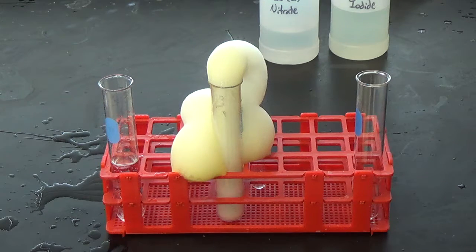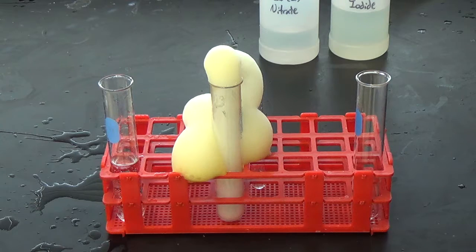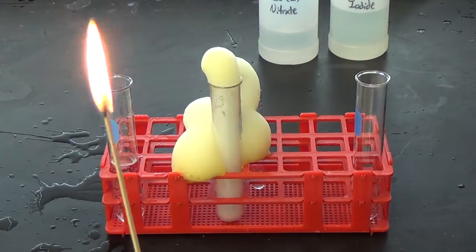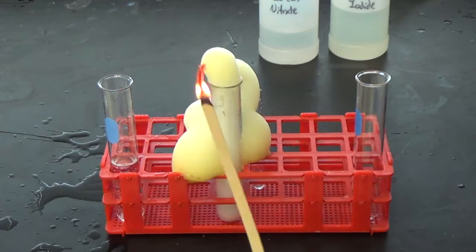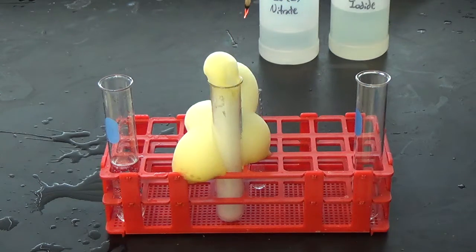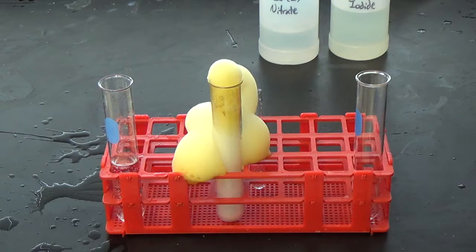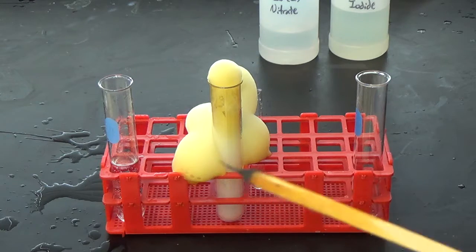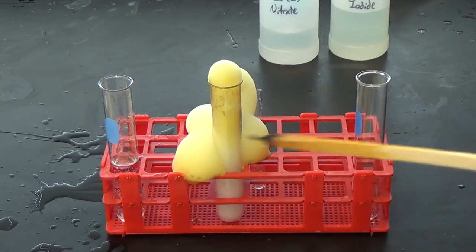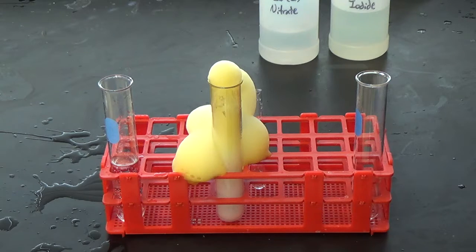We're starting with hydrogen peroxide. We're making one of the products as a gas. We're going to test for that gas. The test I'm going to do is called the glowing splint test. This is a flaming splint. I start with the flaming splint until it goes out, and there's the glowing splint. I'm going to stick that into the bubbles. The wood catches back on fire as it goes into the bubbles. What must be in those bubbles that would help the glow to burn? What gas helps anything to burn? That would be the gas in the bubbles. Now you have a clue as to what the gas was, and you have to figure out what the other product was. That was Reaction 4.